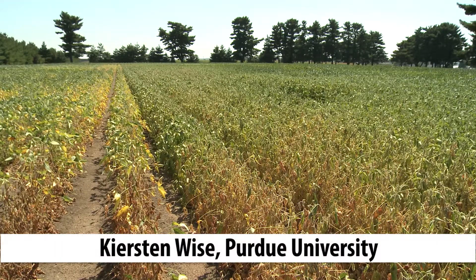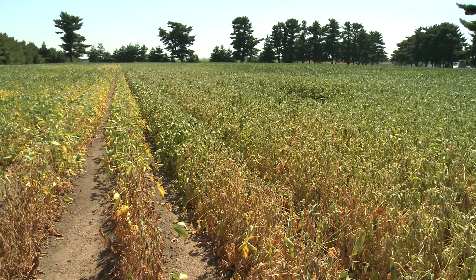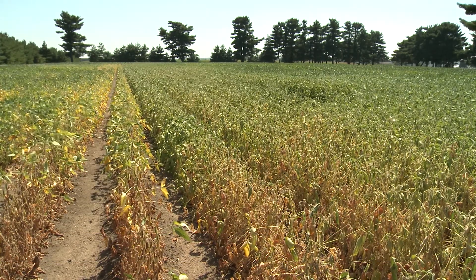I'm Kirsten Weiss from Purdue University and today we'll show you how we quantify the fungus that causes charcoal rot in soybean stems.